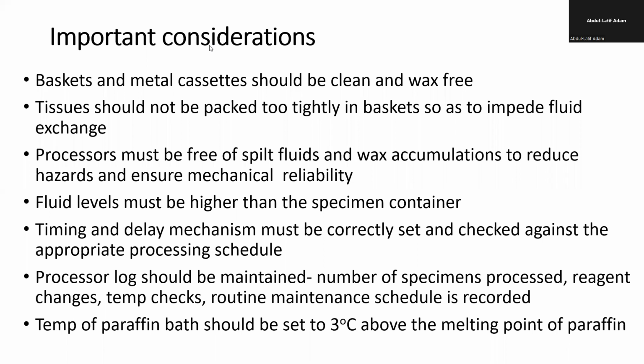Okay. And then you also have to be sure that when you're packing the cassettes that contain the tissue you're going to process, they shouldn't be packed too tightly. You have to create space so that the fluid can move through and it will not impede the exchange of the fluid. Also you should avoid spillage, because if you spill xylene around, there is a tendency to catch fire if there is naked fire around.